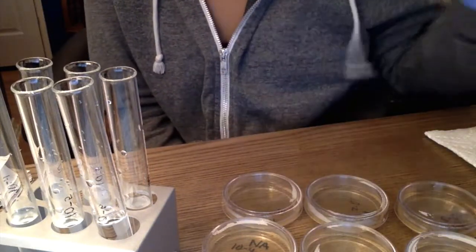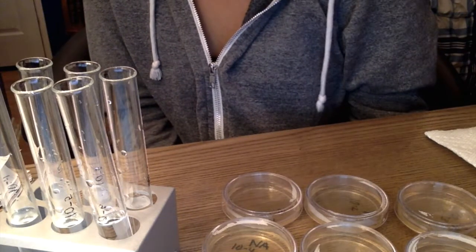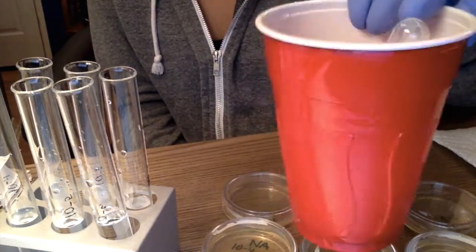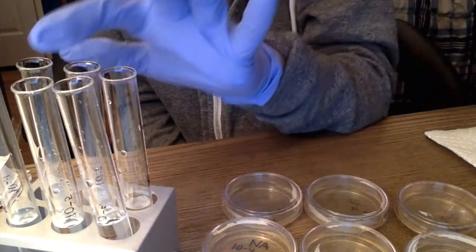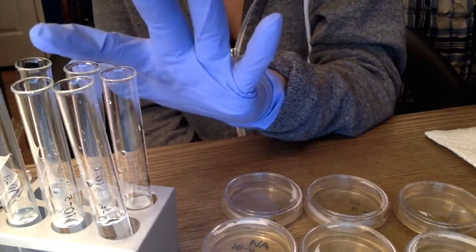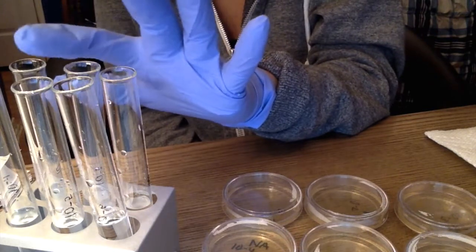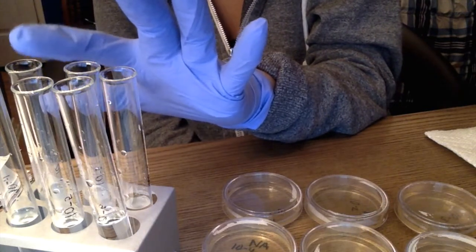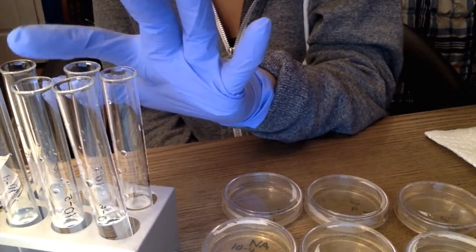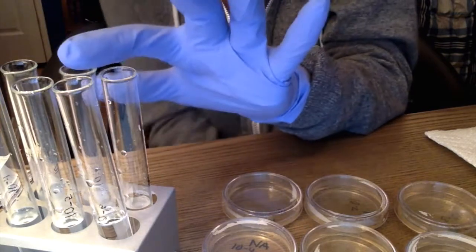So after I let the S. cerevisiae solution sit, I added 0.25 milliliters using my pipette into the first test tube, 10^-1. Now, after making sure that all of that solution and all the organisms were able to go into this original amount of distilled water, I then transferred 0.25 milliliters of 10^-1 solution into 10^-2.